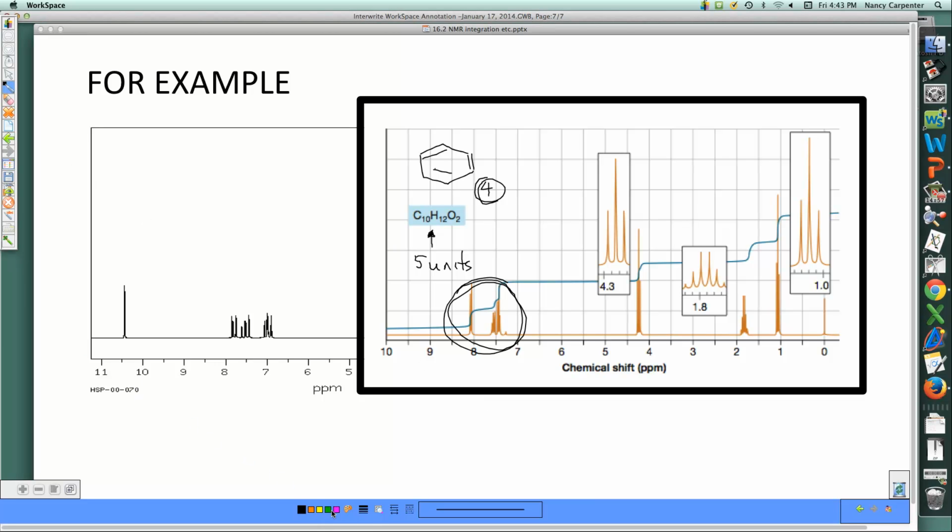All right, I'm going to wrap this one up because it's getting long enough, but let me just point out, when I'm looking at these things, I'm saying whatever this molecule is, it has 4 different sets of hydrogens. This is one set of homotopic hydrogens. This is another. This is a third. And the aromatic ones, they're kind of dodgy, but they're basically all in the same region.